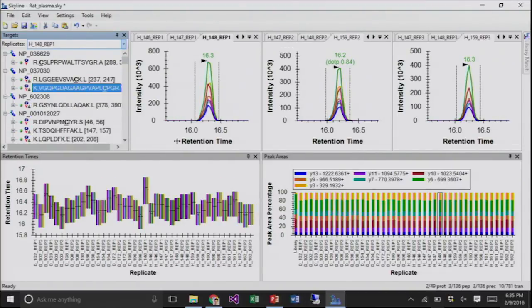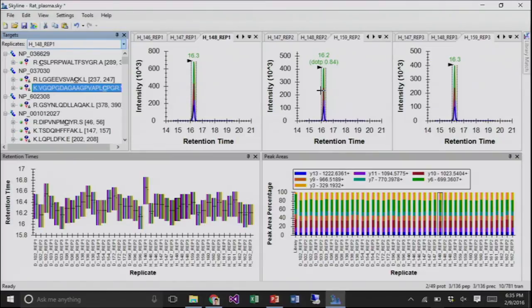This is pretty much the ideal integration, right? And ideal selectivity. So if you're zoomed in like me, hit Shift F11, there is nothing else to select here. There is nothing you would count as a potential peak. You look down at this retention time plot, it's straight across.